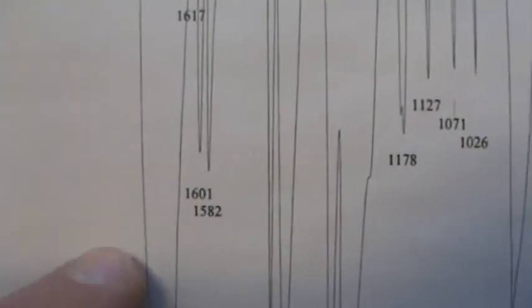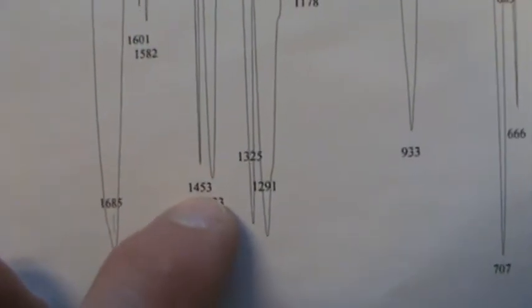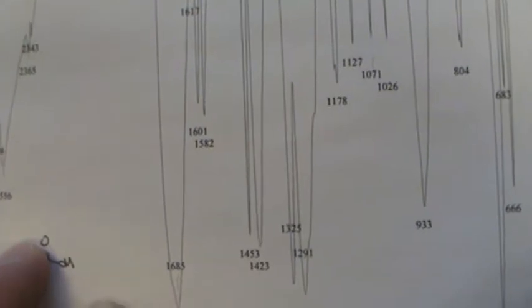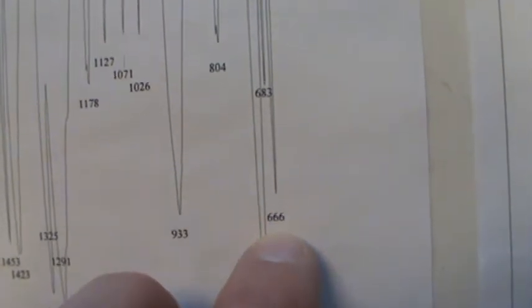There's an aromatic ring, which means, as usual, you see 3 to 4 peaks: 1600, one just at 1582, and then usually the 1453. These three are usually considered to be the C=C stretch of an aromatic ring. It's a mono-substituted ring, so we expect 2 peaks if we can see them. Now, thankfully, we can easily see 707, 666. Wow, I didn't plan that. These two would be your out-of-plane bend of a mono-substituted ring.